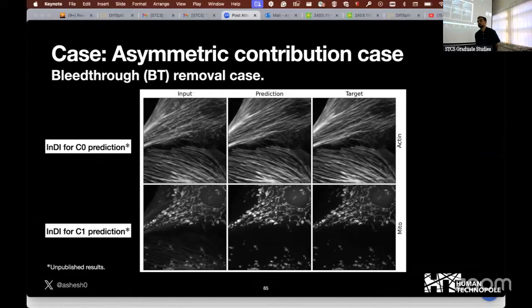In that case, what if the specs that you see in the bottom channel are actually because the structure is organized such that the intensity is lower in some parts and higher in others? Right, that can happen. The intensity of your sample can also lead to the erasing of that particular image. Is there an artifact to the system?